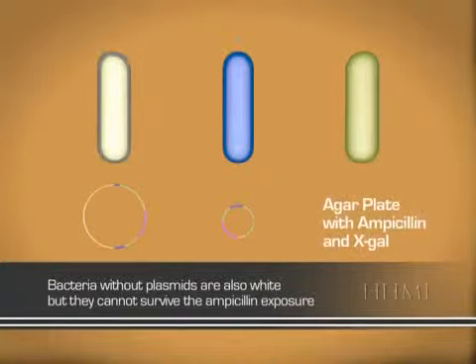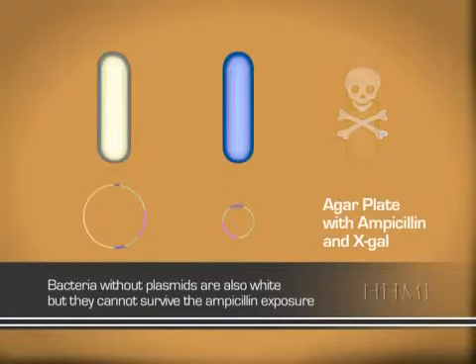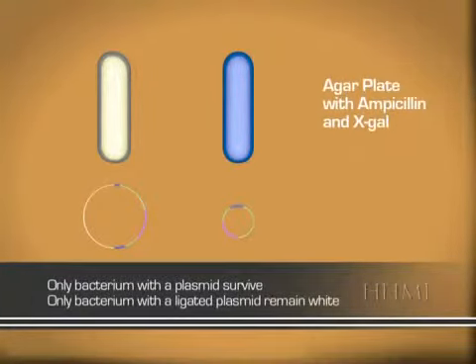We plate the bacteria that have been exposed to our plasmid on plates containing X-gal and ampicillin. The use of ampicillin kills any bacterium that does not have a plasmid in it. This means that all of the white colonies on the plates will represent bacteria that have plasmids containing our fragments. Once the E. coli has time to grow, we will know which bacterial colonies have cloned fragments of your genome in them. For the first time, we will be able to see which colonies have the genome plasmids, because the colonies will be white. Let's let these incubate for 18 to 20 hours at 37 degrees Celsius.